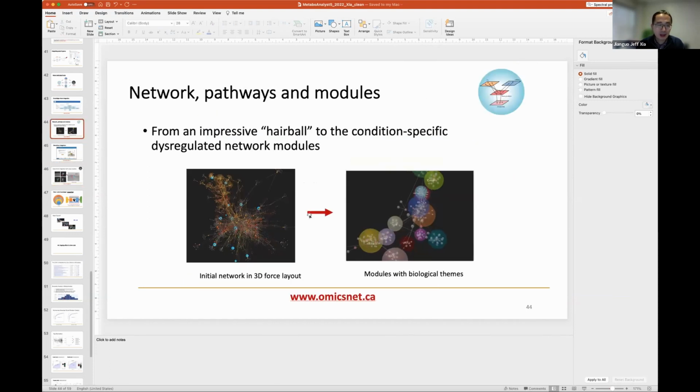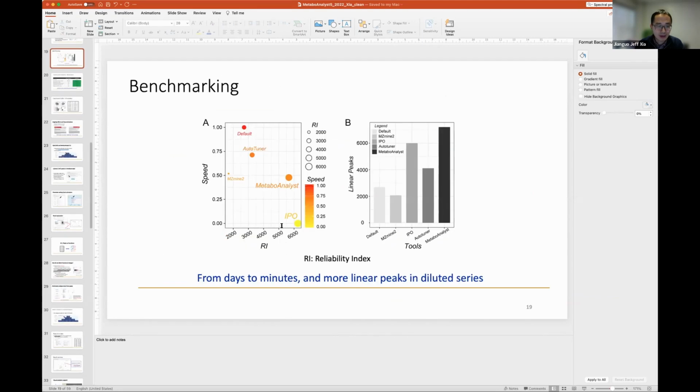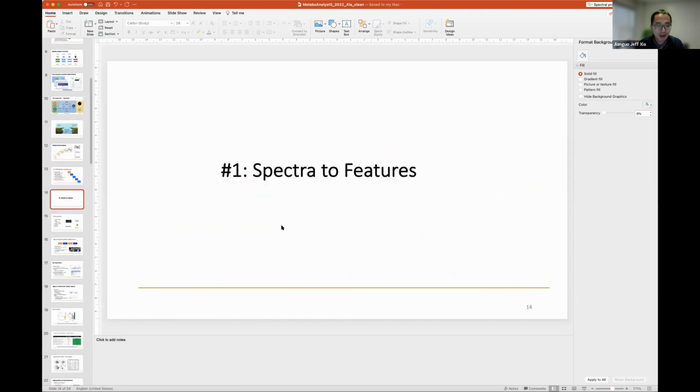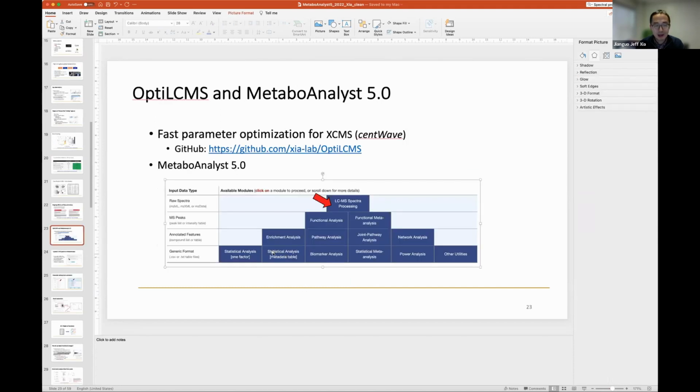Regarding the second one, we have actually already addressed it, and hopefully we're starting to address it, in a way. MetaboAnalyst already has the capacity to deal with metadata from clinical data. Let me see here. If you see this one, statistical analysis, metadata table, you upload your metabolomics table as compound concentration or peak intensity. Your metadata table is also another table, of clinical metadata. We have an example here, which is all COVID. We have all the clinical COVID data, and usually you have about 12 columns: gender, status, age, high blood pressure, or the cytokine count, everything, and you can do a co-analysis together with the metabolomics.